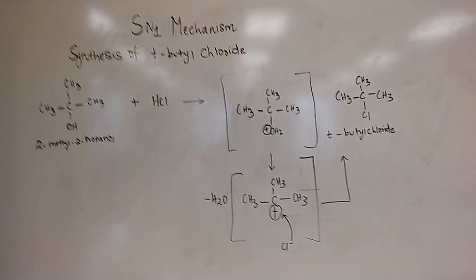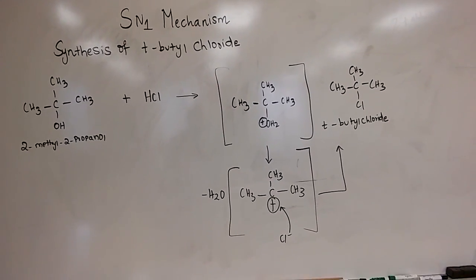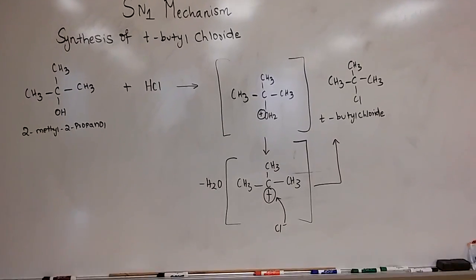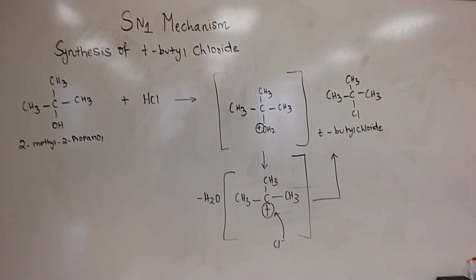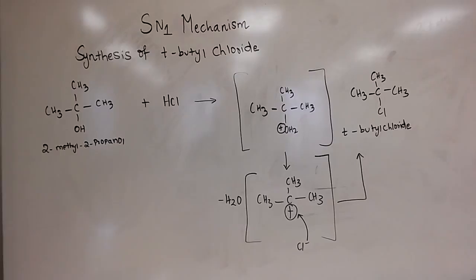You just want good reflux. You don't want the liquid bumping all the way into the condenser, and that's not something you want. Okay, so this is a pretty simple lab. Simple doesn't mean fast, but it is simple in terms of what you're dealing with. All right, now when I come back, I'm going to walk you through the ingredients and the setup.